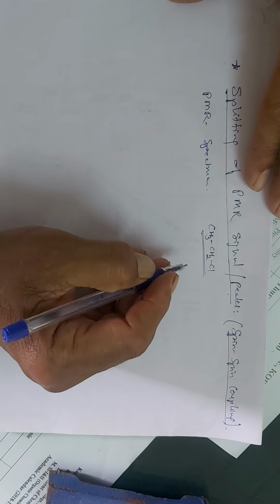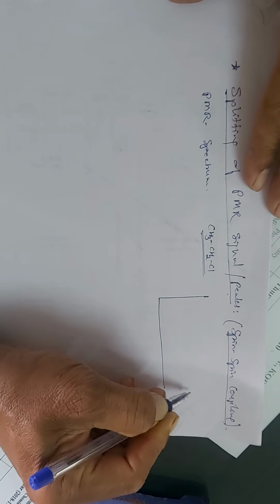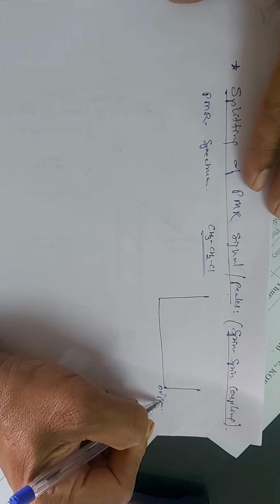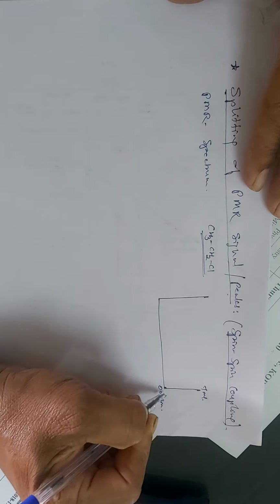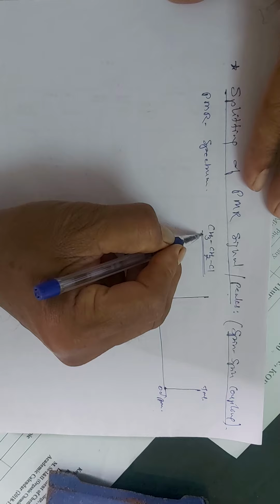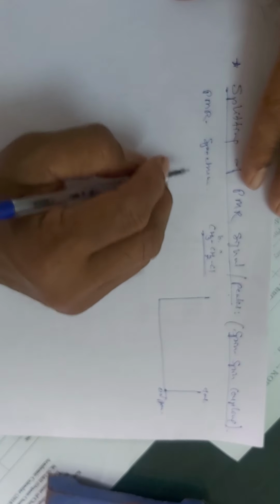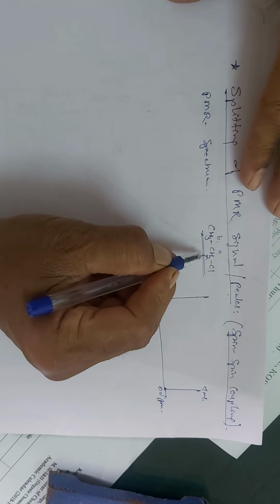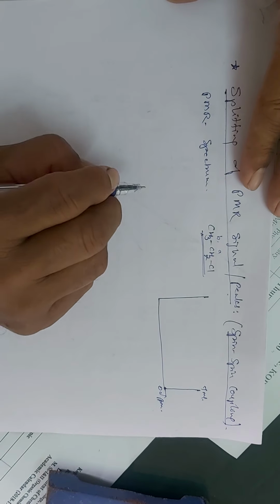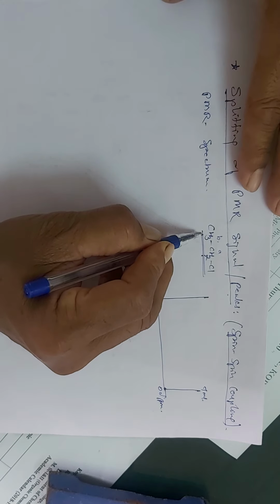If we take the spectrum of CH3CH2Cl, that is ethyl chloride, we will get a spectrum with respect to 0 del parts per million, where the TMS signal is. With respect to this, there are two types of protons, A and B, so you are supposed to get two signals. One signal A is responsible for 2 protons and one signal B is responsible for 3 protons. Which is shielded and which is de-shielded?